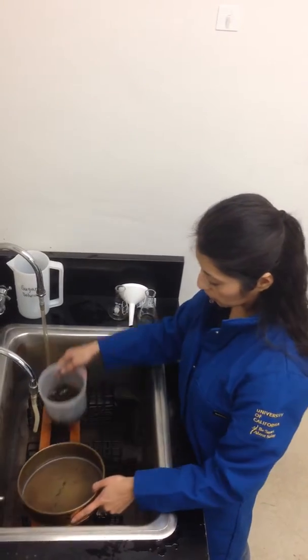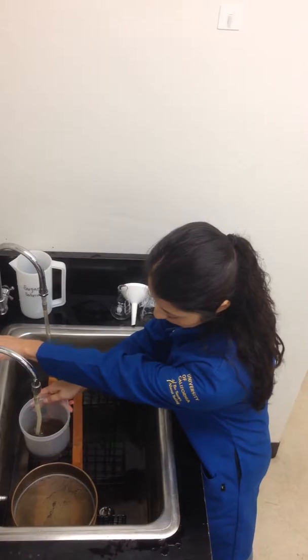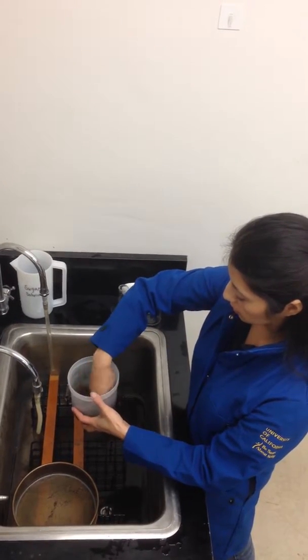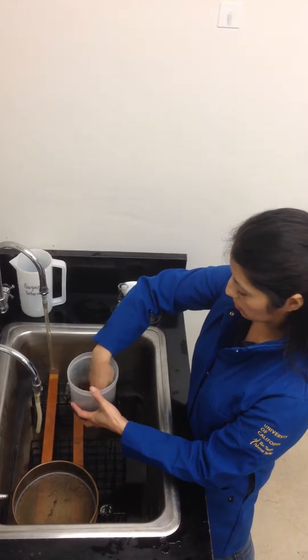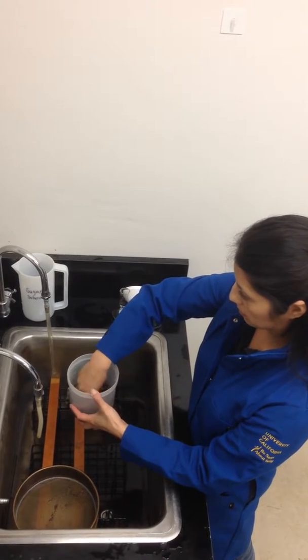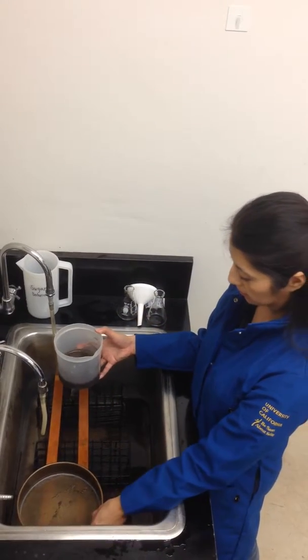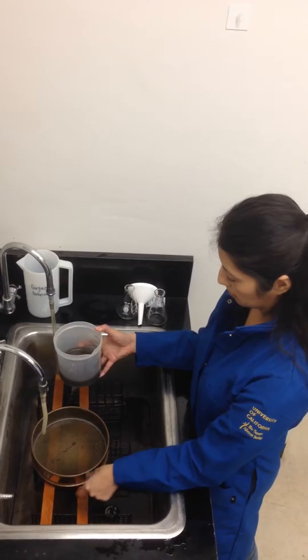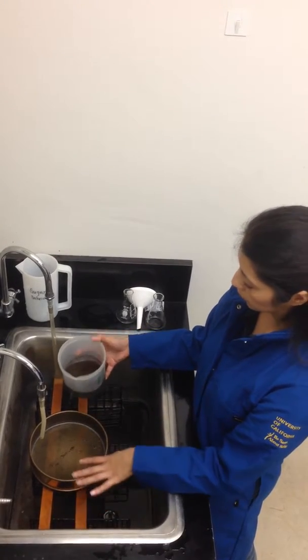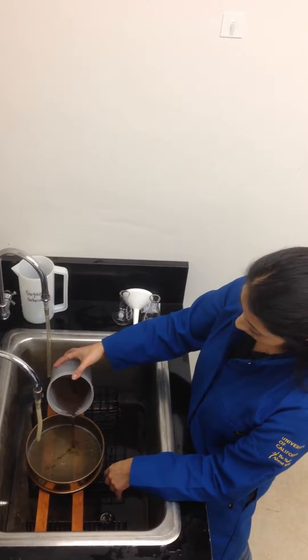Add about one to two inches of water, and then we're going to stir it with our fingers. And then let it settle for about twenty seconds. After twenty seconds we're going to pour the contents that are floating into the fine sieve.